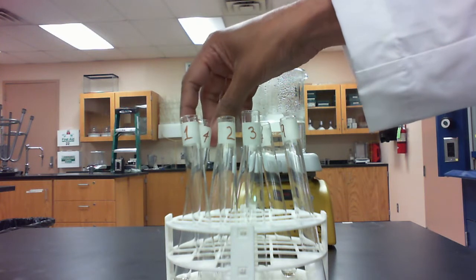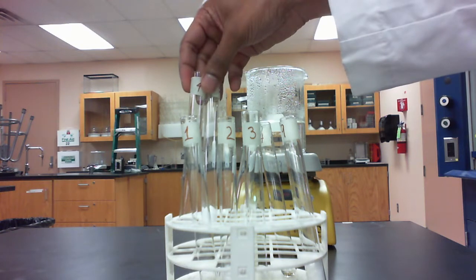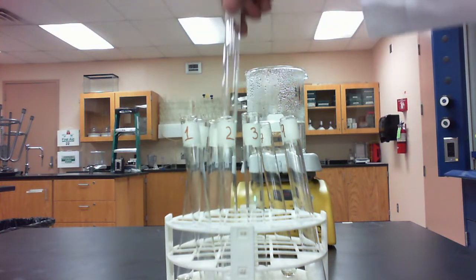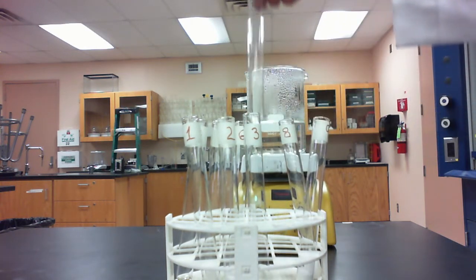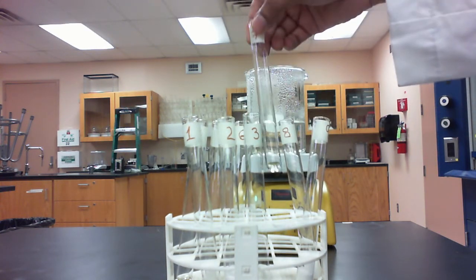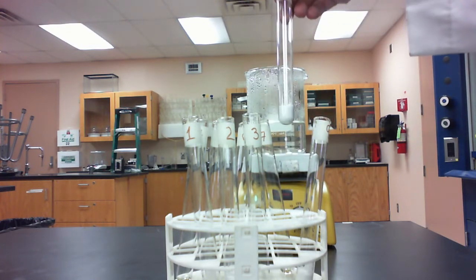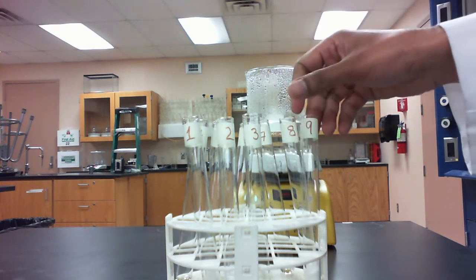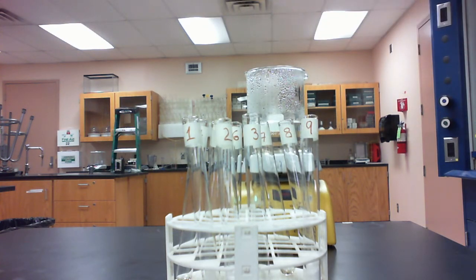And in my remaining test tubes, I sort of repeat that. So in test tube 4, I have 1 ml of the acetic acid. In test tube 5, I have about 1 gram of the benzoic acid. And in test tube 6, I have 1 gram of the salicylic acid. And then in test tube 7, 1 ml of the acetic acid. Test tube 8, 1 gram of the benzoic acid. And in test tube 9, 1 gram of the salicylic acid. So the next step would be to add the corresponding alcohol to each of these tubes as outlined in your instructions.